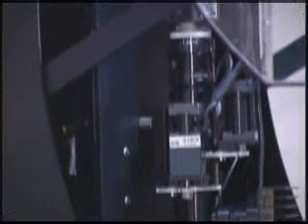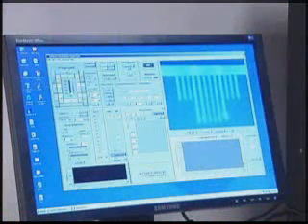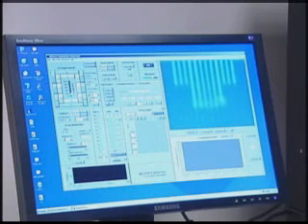The instrument is a very interesting instrument. It's similar to an atomic force microscope. So what it uses is very small cantilevers, kind of like a fountain pen, to be able to print very small spots of fluids on surfaces.